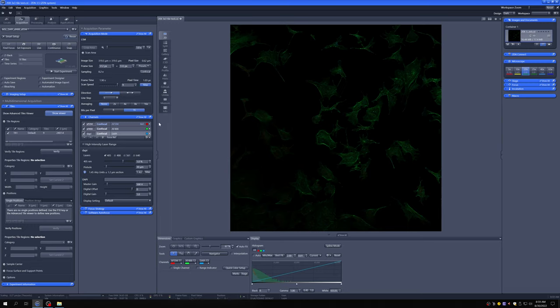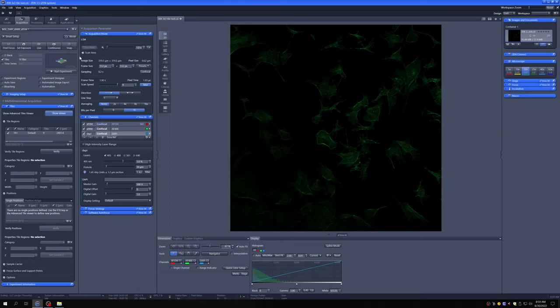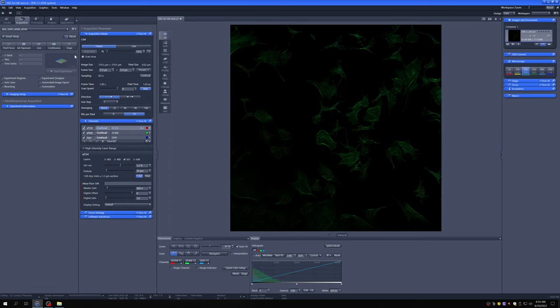Now we don't want to do that at this time, so I am just going to reload this, which I can do by clicking here and saying reload. When it has an asterisk, what it means is that whatever is here has changed from the setting you loaded.